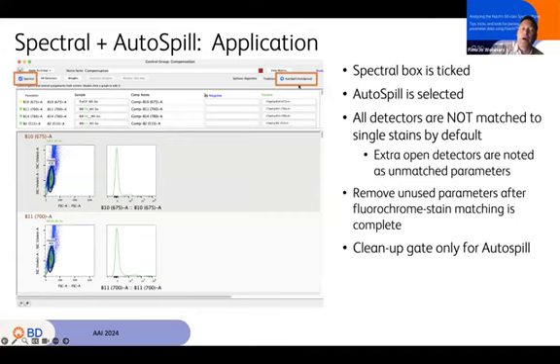The auto spill box is right here. You'll click that. So it's traditional versus auto spill here, where traditional means using gates. We could probably call that gate-based or ye old compensation, as again, Sabine Iverson, great name. And then spectral versus traditional over here just means spectral. We're going to use all the detectors that we want versus one per color.